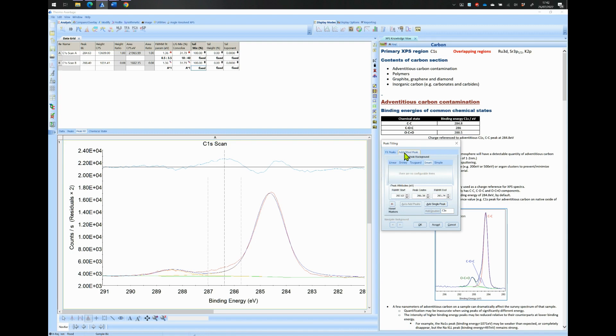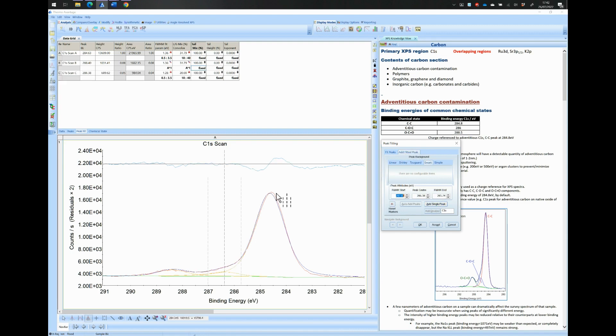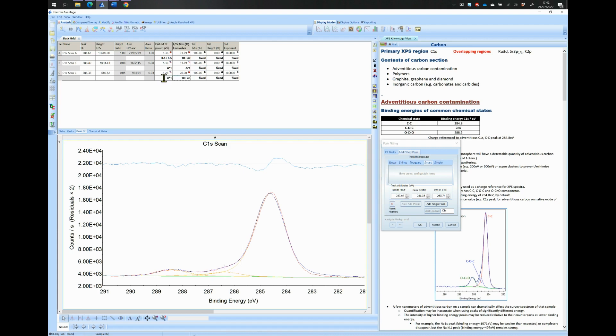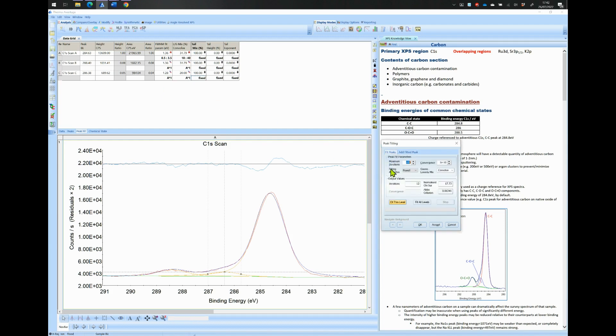Add another peak by clicking onto the Add Fitted Peak tab and click on Add Single Peak. Make sure this new peak is located around 286 eV. Also make sure that you have constrained the width and LG ratio of this new peak to the ones of peak A. Then click on to fit this level.